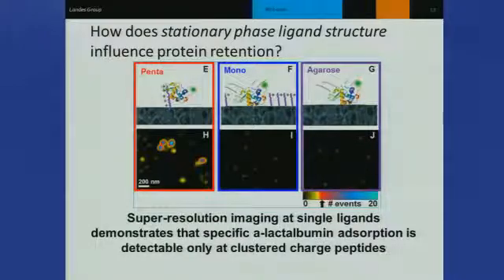Because we have such low concentrations of our protein, we should see this completely isotropically all over the surface. Every once in a while, and every place around the surface completely homogeneously, we should see one of these fast events that's based strictly on our protein getting sterically trapped for a moment in our porous stationary phase.